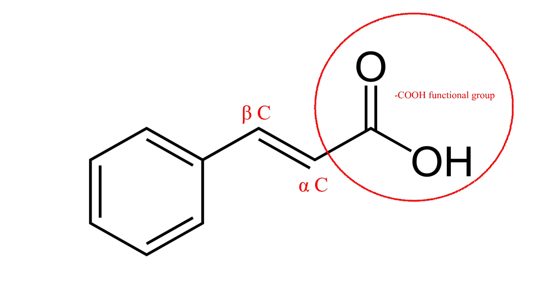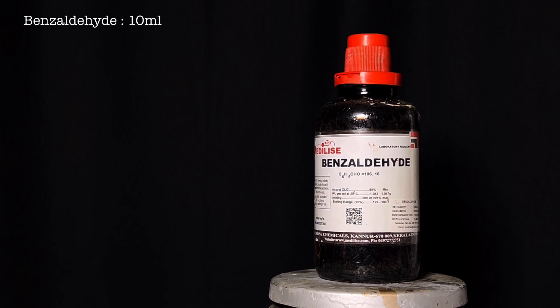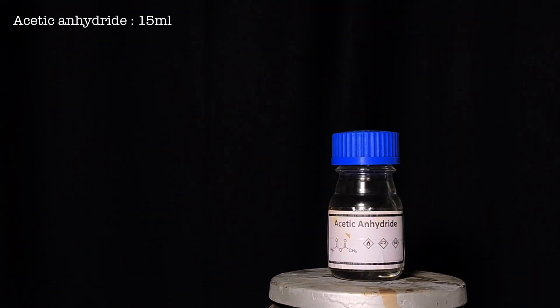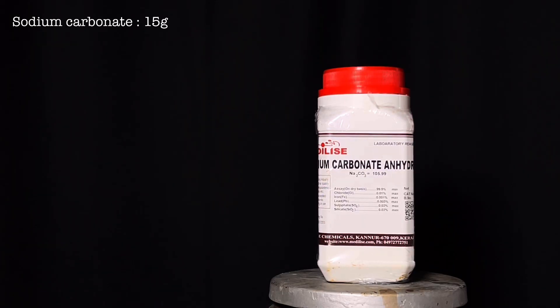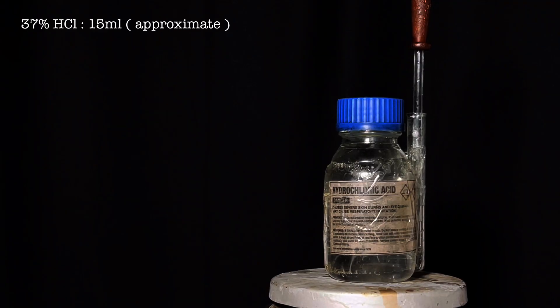For this synthesis, you will need 10 ml of benzaldehyde, 15 ml of acetic anhydride, 5 g of sodium acetate, 15 g of anhydrous sodium carbonate, and approximately 15 ml of 37% hydrochloric acid.